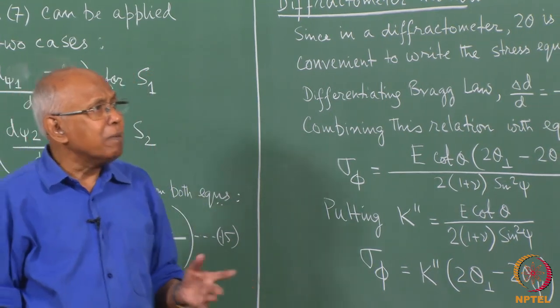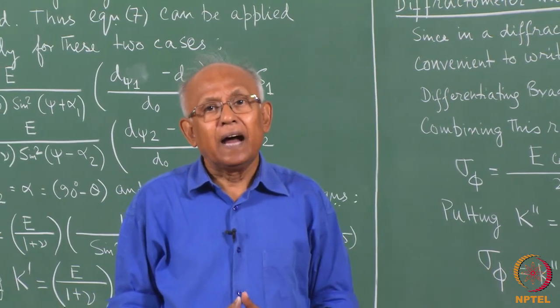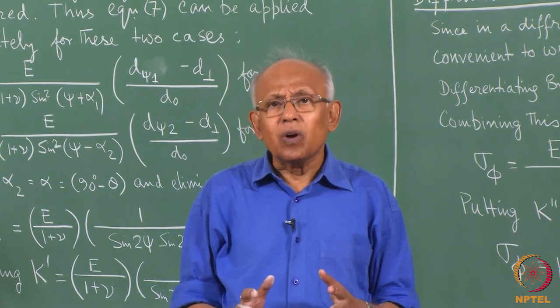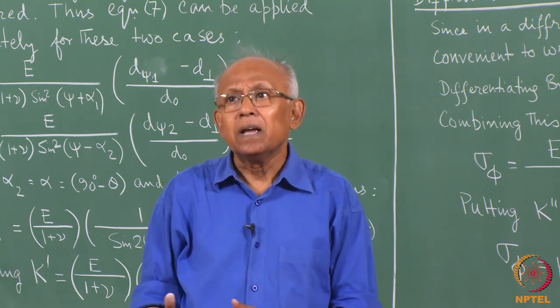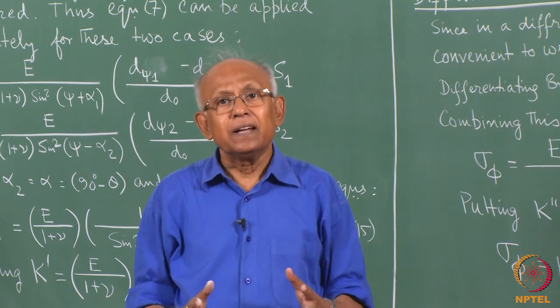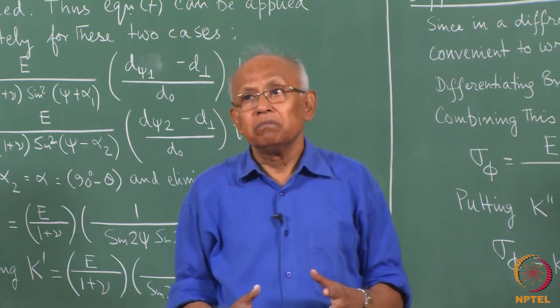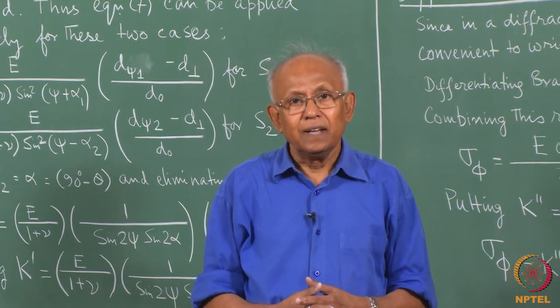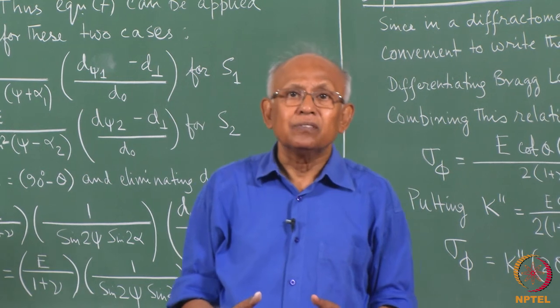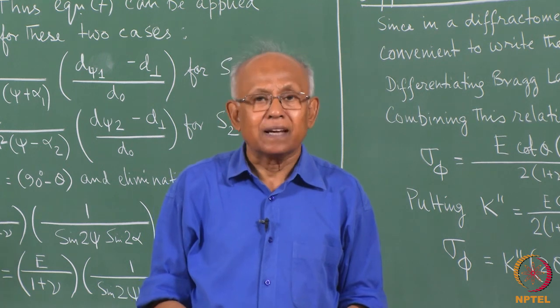Now, coming to a conclusion, stress measurement by X-rays is quite useful when we deal with highly localized stresses in a material which vary over a distance from place to place. There the X-ray method is very useful compared to electrical or mechanical gauges. In fact, for residual stress measurement, the X-ray method is undoubtedly better than the electrical and the mechanical strain gauges.